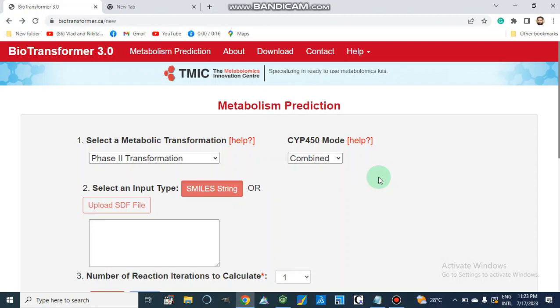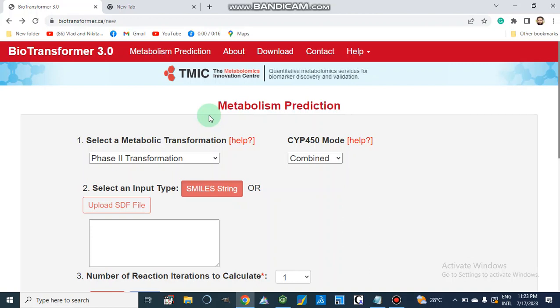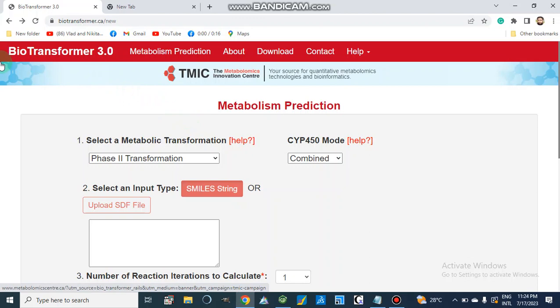Today I am going to show you an important tool which can be used for the prediction of metabolism. Metabolism is an important parameter during pharmacokinetics prediction or ADMET profile prediction. In metabolism of our compounds we get information about how our compound will be degraded inside our body or in an abiotic environment. The tool name is BioTransformer 3.0.